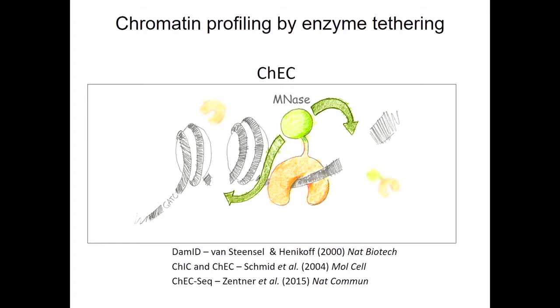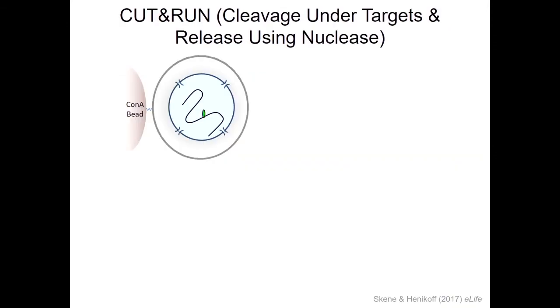So what I'll tell you about is an implementation that we've spent a couple years on, really, of this ChIC method, which is chromatin immuno cleavage. Okay? And we implemented it into a format that was a sequencing-based format. And the method really has a number of features which improve the efficiency and sensitivity of the method and really give you a very general method for looking at chromatin. Okay? And I'll go through some of the features.